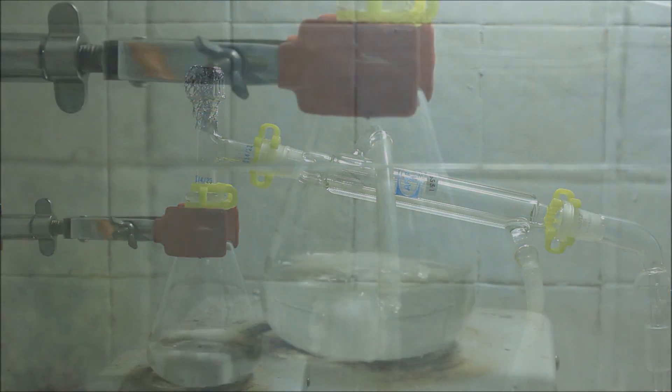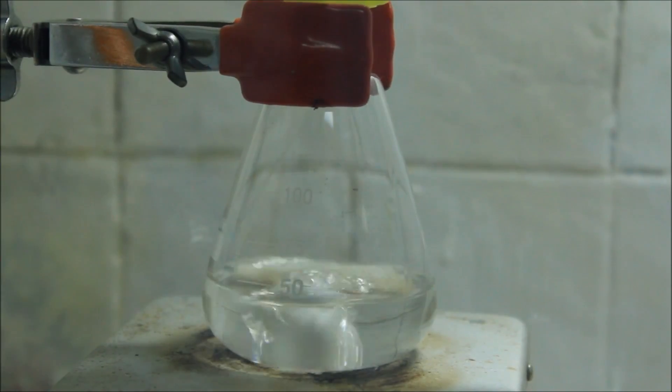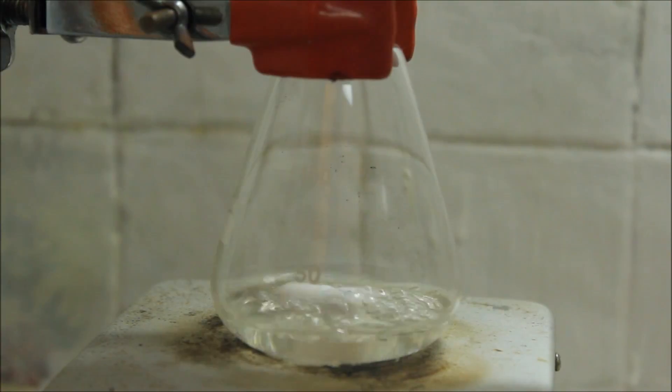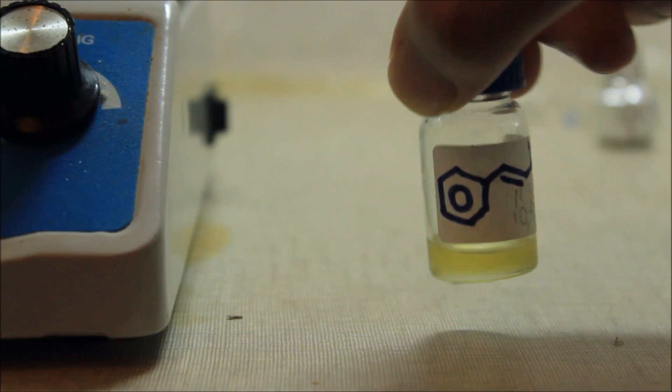The majority of the solvent is removed using a simple distillation setup. The last amount of solvent is removed by flushing air through it. At the end, we obtained a slightly yellow oil.